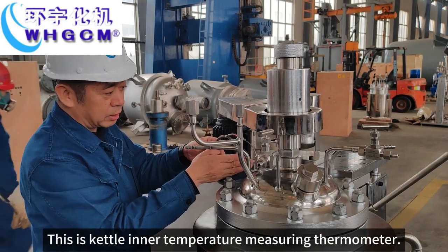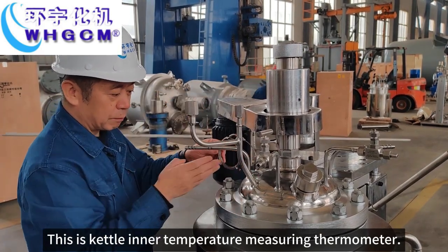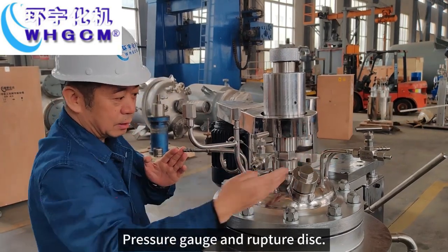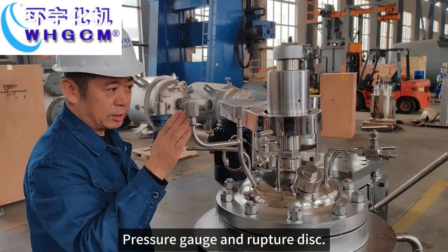This is the kettle inner temperature measuring thermometer, kettle inner coil inlet and outlet, pressure gauge, and rupture disk port.